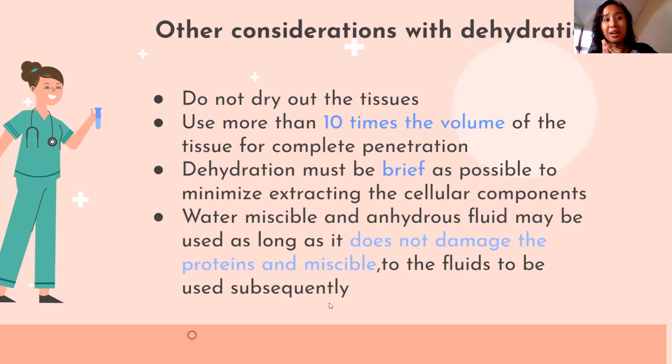Yan, yun ay minimum na 20 times. Ano na yun, talagang cost-effective na yun. Ito class, you should use more than 10 times of the volume. Yan. Not 20 times, just at least 10 times the volume of the tissue so that it could fully penetrate your sample.